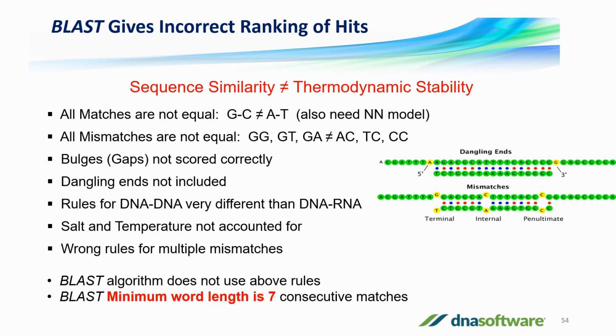It also doesn't account for several other effects, such as the fact that bulges in BLAST are scored based on insertion and deletion frequency. Well, that has nothing to do with hybridization. Bulges are thermodynamically very unfavorable for very different reasons than the reasons scored by BLAST.